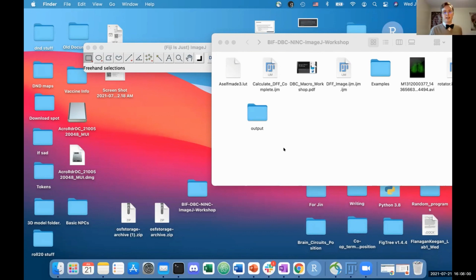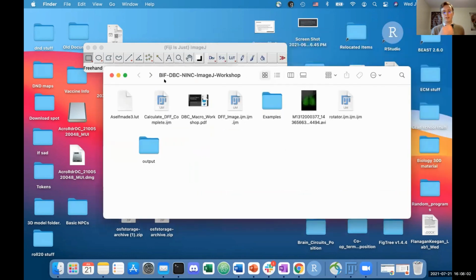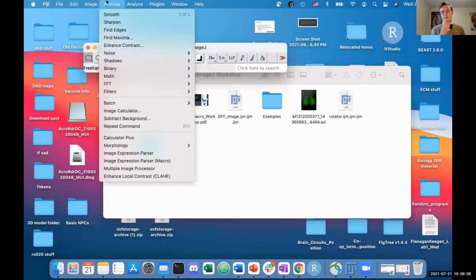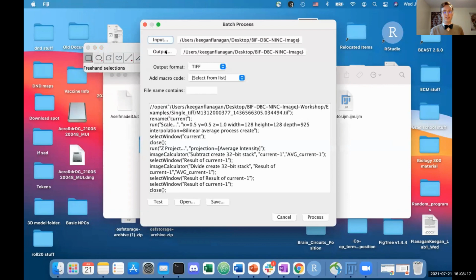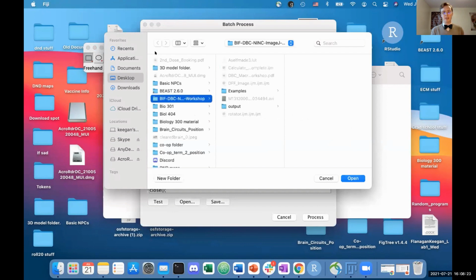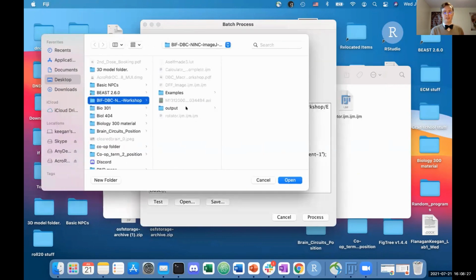Not unless I somehow went wrong when, for example, entering the output for the batch itself. Like if I had specified the output and something had gone wrong and I hadn't selected the correct folder, but I'd never really encountered a specific bug for this situation.